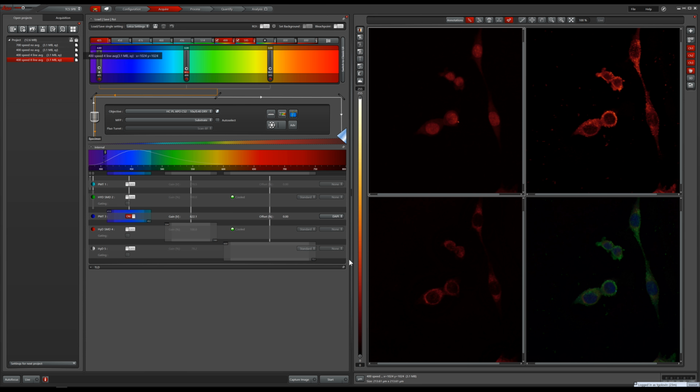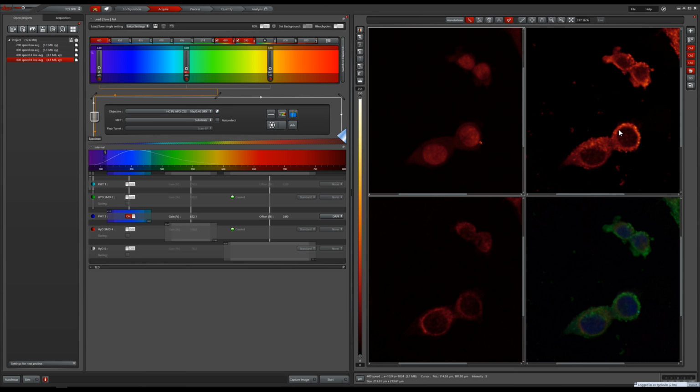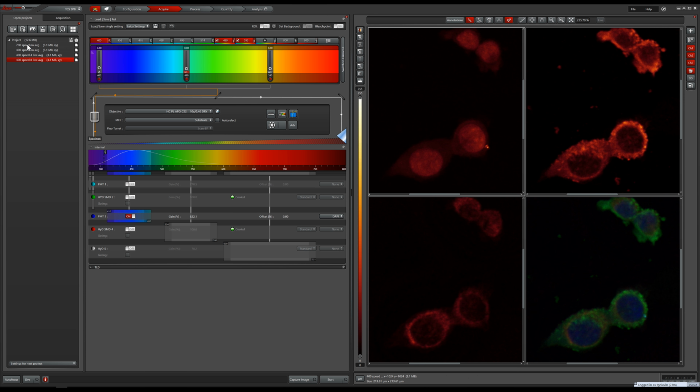conditions. When starting off with a new experimental condition and setting up your imaging requirements, we recommend to take images from different samples in various spots with varying acquisition variations before settling for specific settings. Make sure to disable smoothing in the image viewer to see your real raw image.